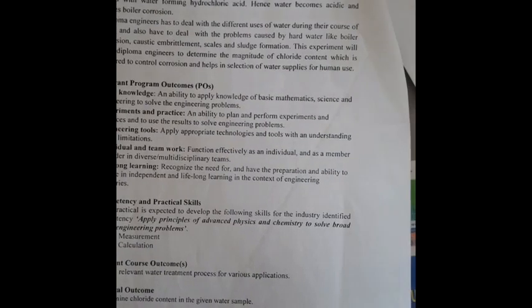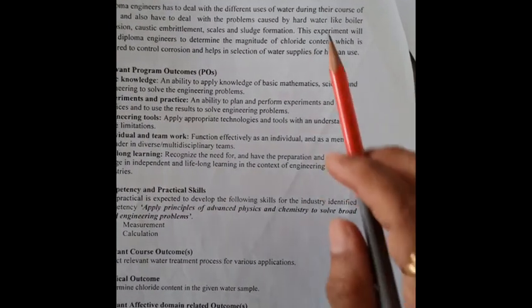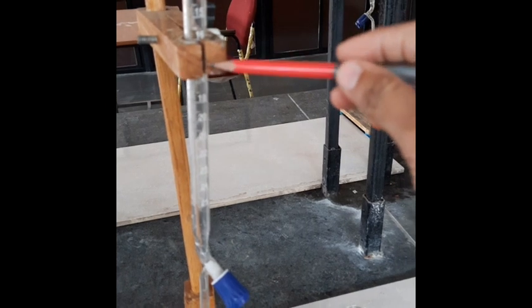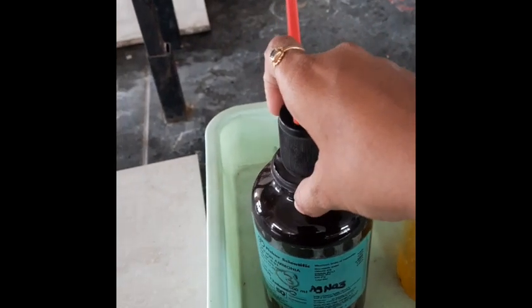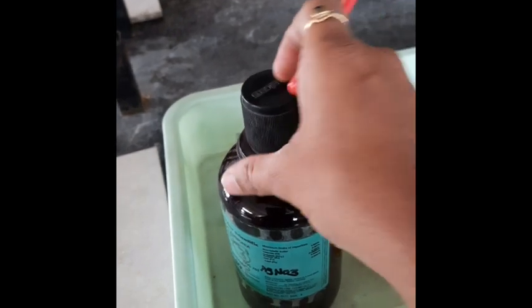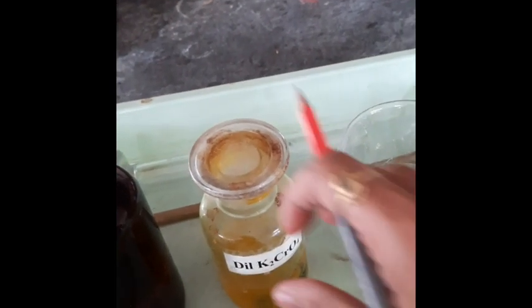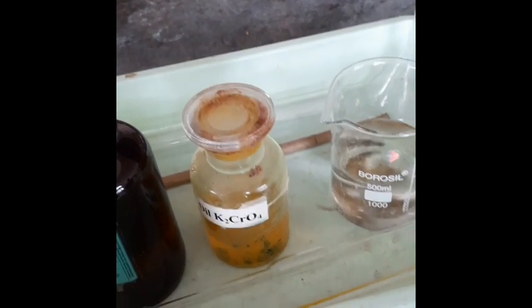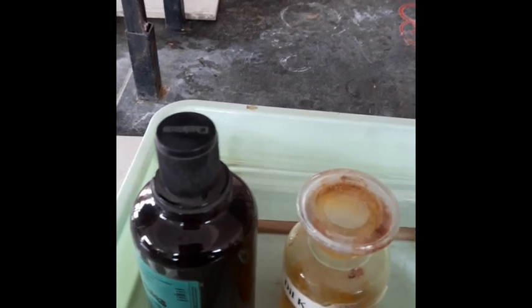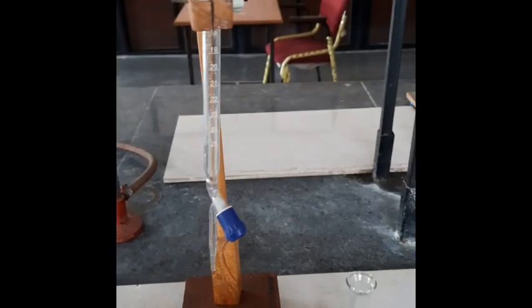Now we are going to see the actual experiment of chloride content of the water sample. Resources required for this experiment: we need a burette and a wooden burette stand. We need 0.01 molar AgNO₃ silver nitrate solution, which is stored in an amber-colored bottle to prevent oxidation of the silver. We need potassium chromate K₂CrO₄ as indicator, water sample, and a 10 ml pipette and conical flask.